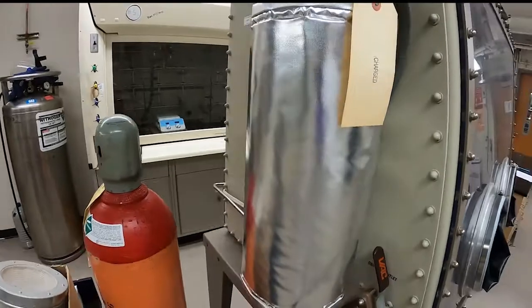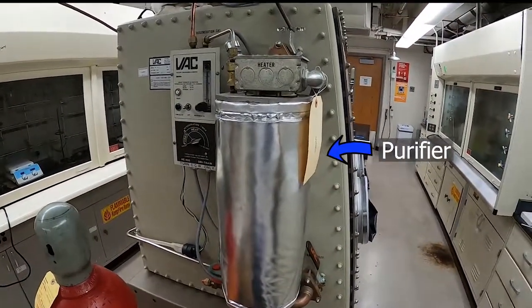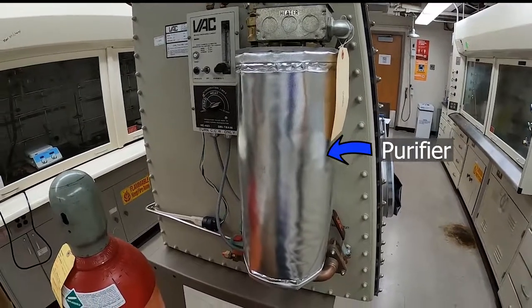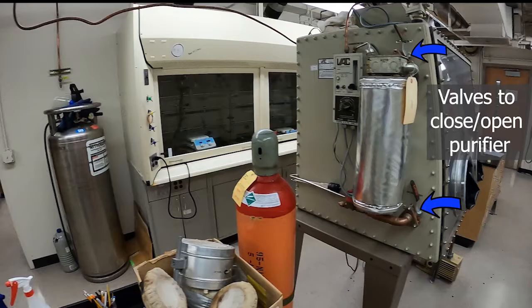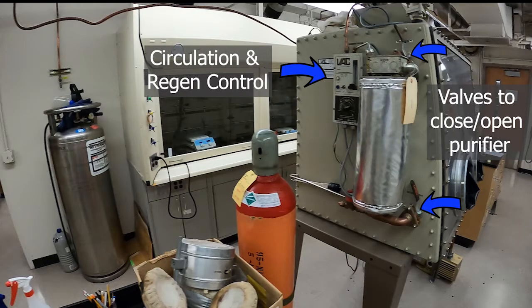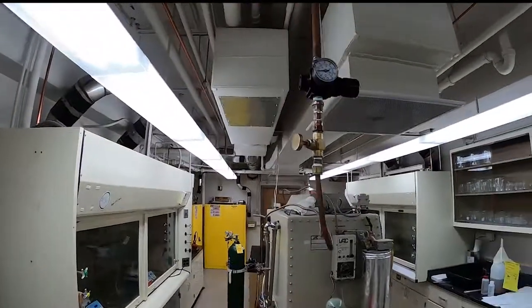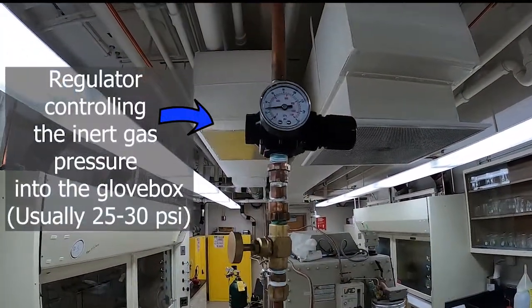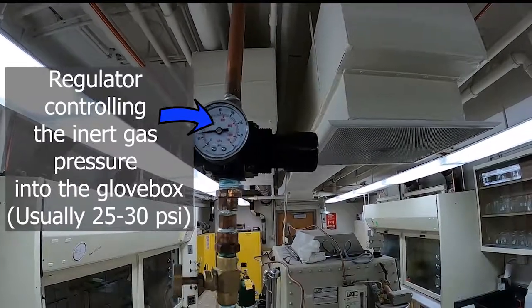Going around the side here, we have the purifier pack. This is the component that maintains the atmosphere in the glove box. We have its inert gas feed line and the pressure gauge for it — this pressure gauge should be at 25 PSI, which it currently is at.